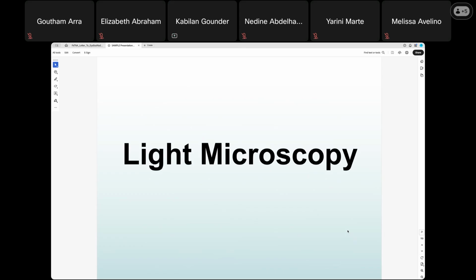So the next topic is the light microscope. So what is the light microscope? Why is it important? And what are the different techniques available for investigators, scientists, and pathologists, and how do they improve the quality of sample preparation, observation, and interpreting the data? So we will discuss that next class.